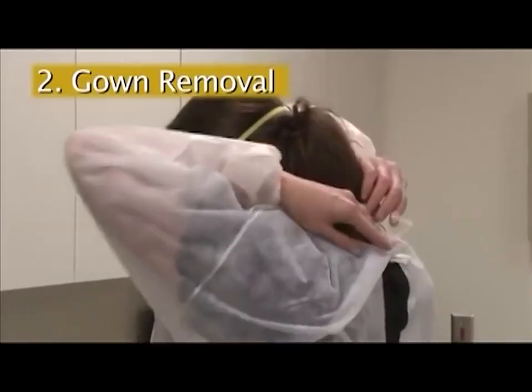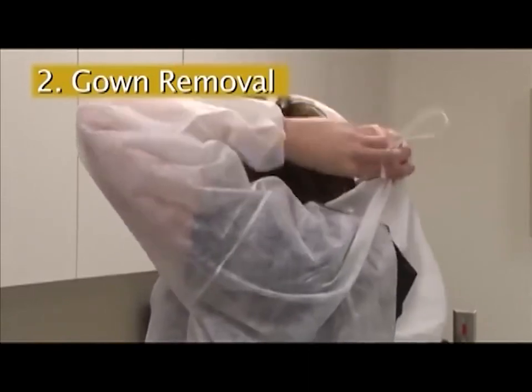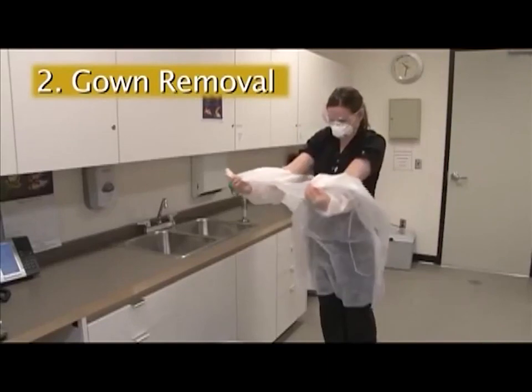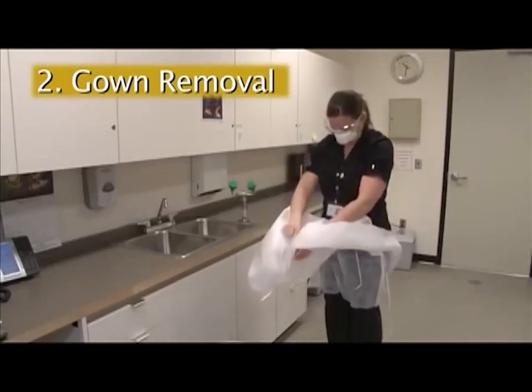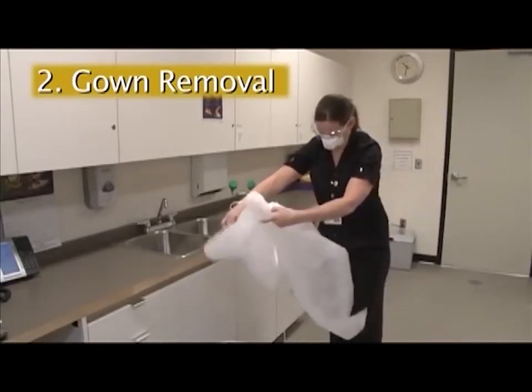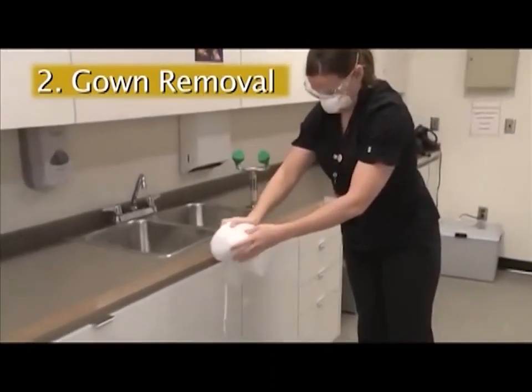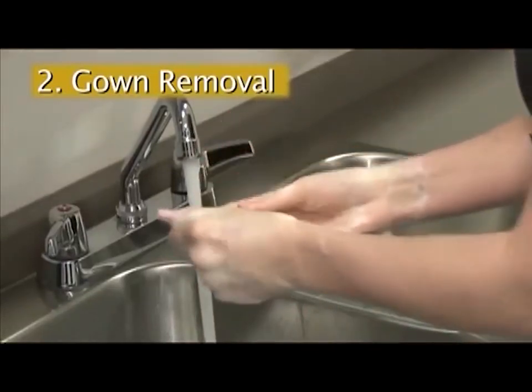The gown front and sleeves are dirty, so it must be handled from the back and inside. Starting at the neck, unfasten the ties. Peel the gown in a forward or downward movement and away from the neck and shoulder, turning it inside out. Fold or roll into a bundle and discard. Perform hand hygiene before proceeding.